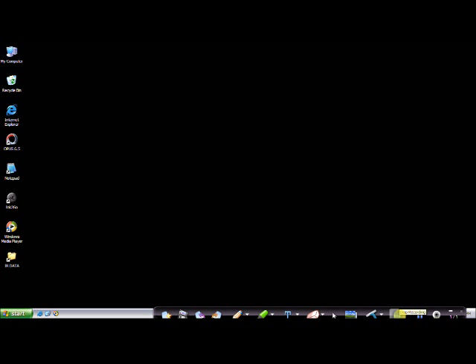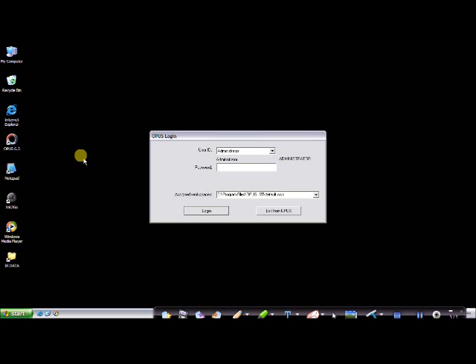On the desktop, you can start by double-clicking the icon OPUS 6.5, after which it will prompt you for a password. You're just going to key in capital letters OPUS. Once again, it's OPUS: Orion, Paragon, Ulysses, and Sigma.